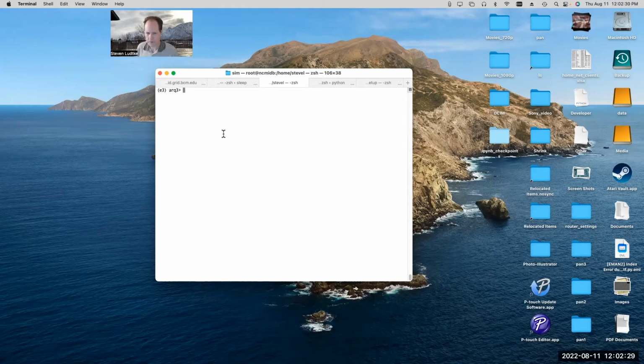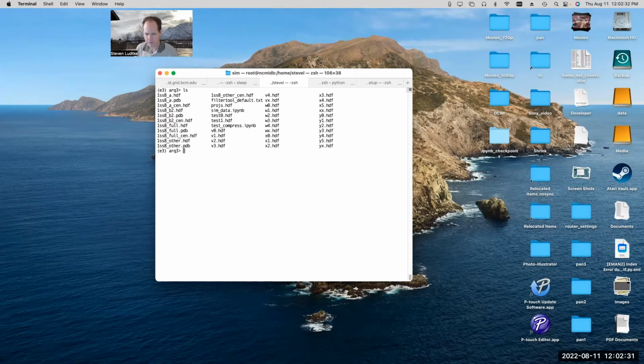So I think we'll just pick up where we left off last time. We were talking about generating simulated data. I posted the Jupyter Labs session. Someone requested that, so I posted that on YouTube if anyone wanted to download it. There's an attachment available below, as an announcement on the YouTube video.